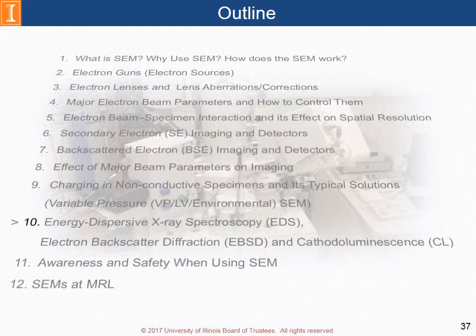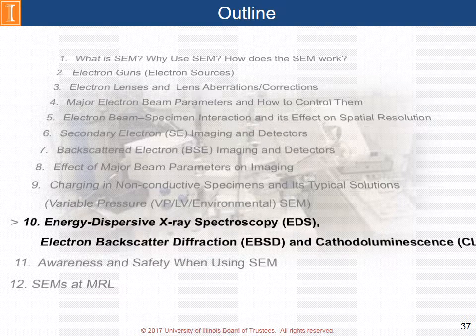In the next few slides, we will briefly introduce a few analysis techniques, such as characteristic X-ray for composition analysis, electron backscattered diffraction for crystallography study, and cathodoluminescence for optical and electronic property analysis.